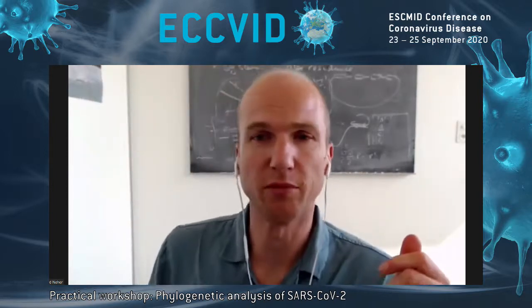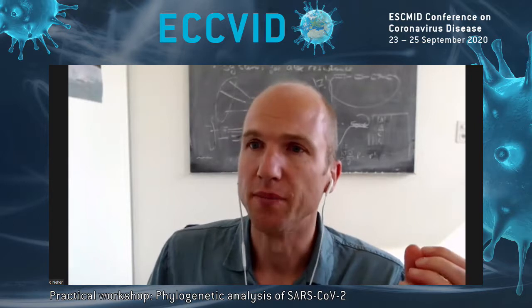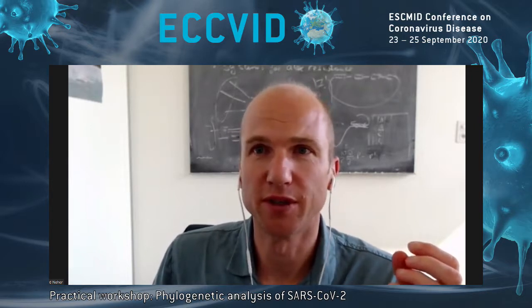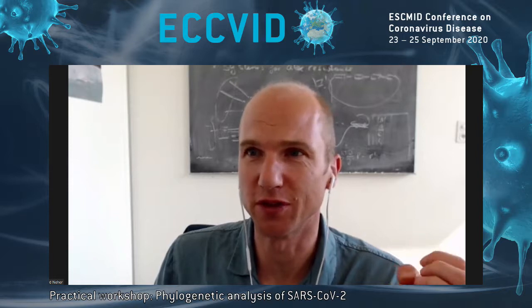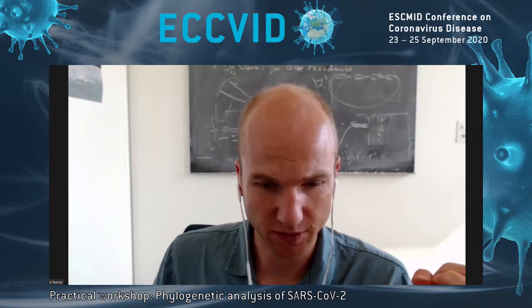So if you mouse over a particular sequence there, you should see that some diagnostic primers might be affected by diversity in these sequences. But yeah, please come, play around and put your questions into the chat or the Q&A box, so that we can interact with you guys for a little longer.